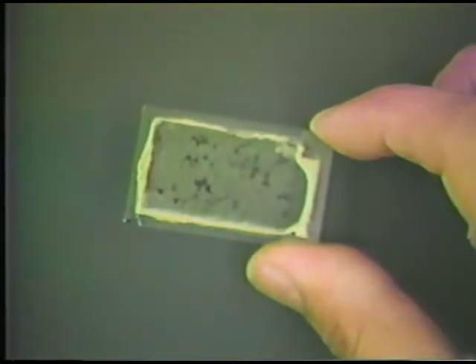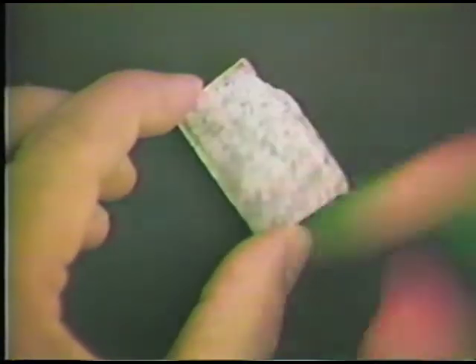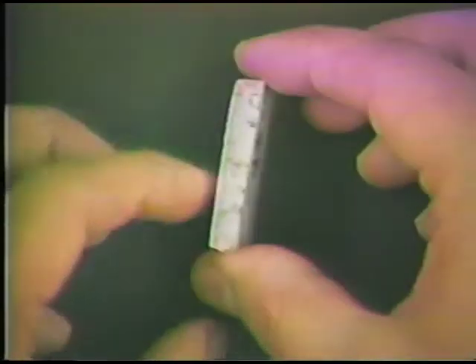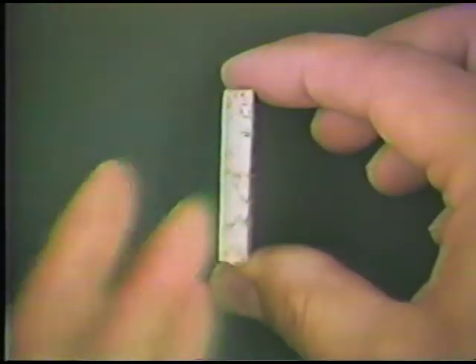The specimen started out looking like this. This is essentially just a slab of rock. You can see the different minerals in the granite. It's been cut with a special saw, so that we have an orientation here. And we're going to take this specimen and prepare it.